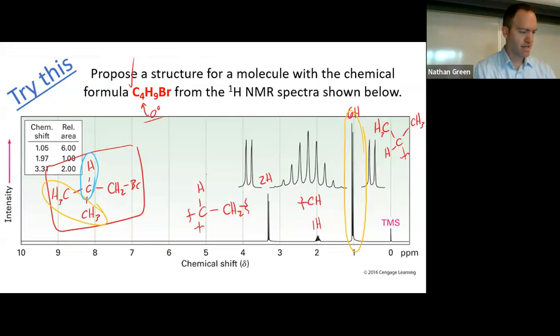This carbon has a hydrogen and there's a methyl here, here, and here. So this has 3, 6, 7, 8 neighbors, which means its peak is going to be split into 9 total peaks. And if you count up these little ones over here, 1, 2, 3, 4, 5, 6, 7, 8, 9. You don't do that. You just say it's inundated. They live in a crowded neighborhood. They are surrounded by noisy people. That's this signal.